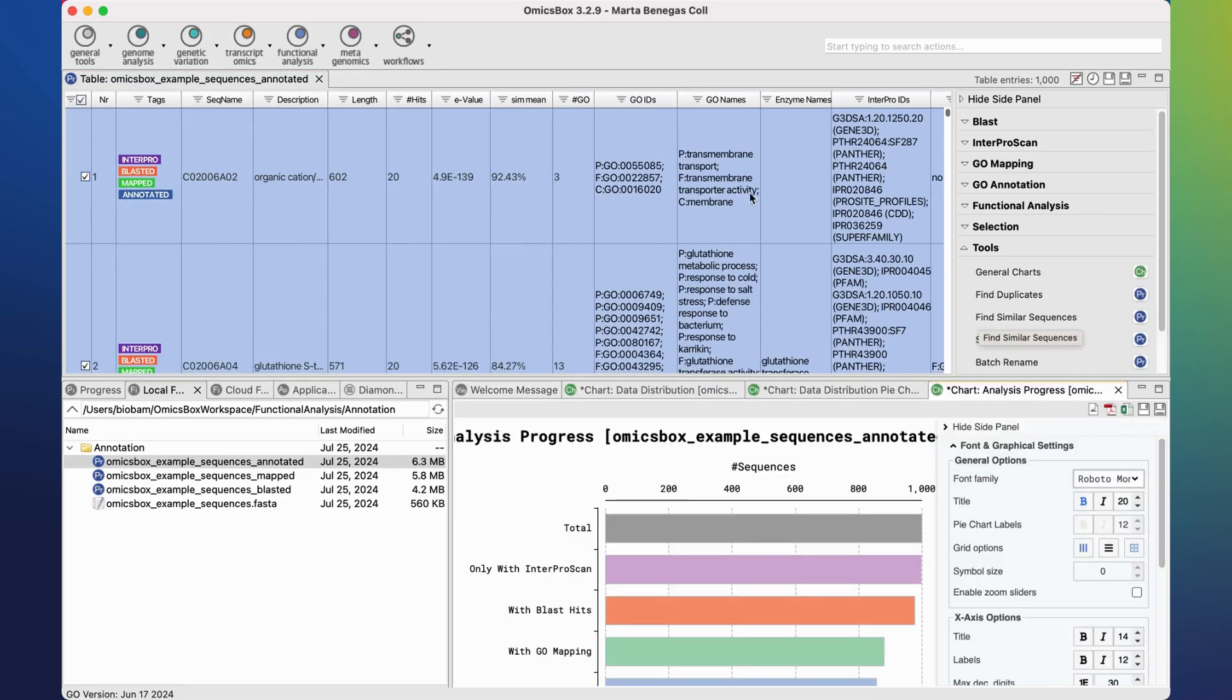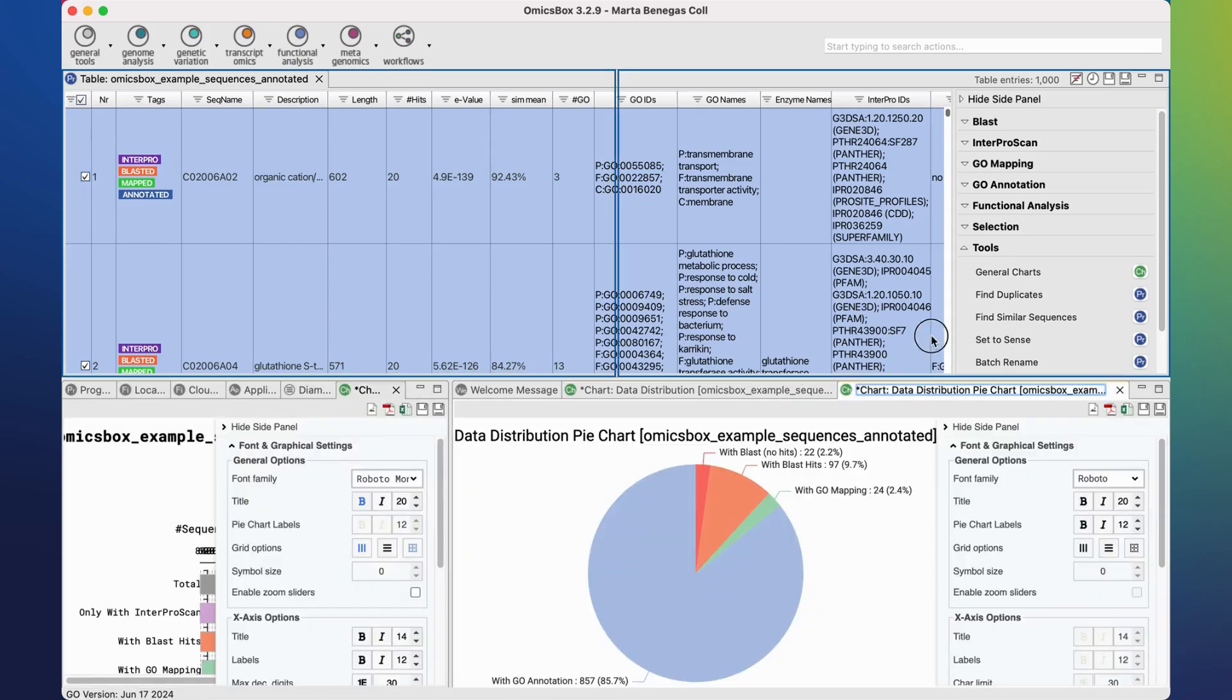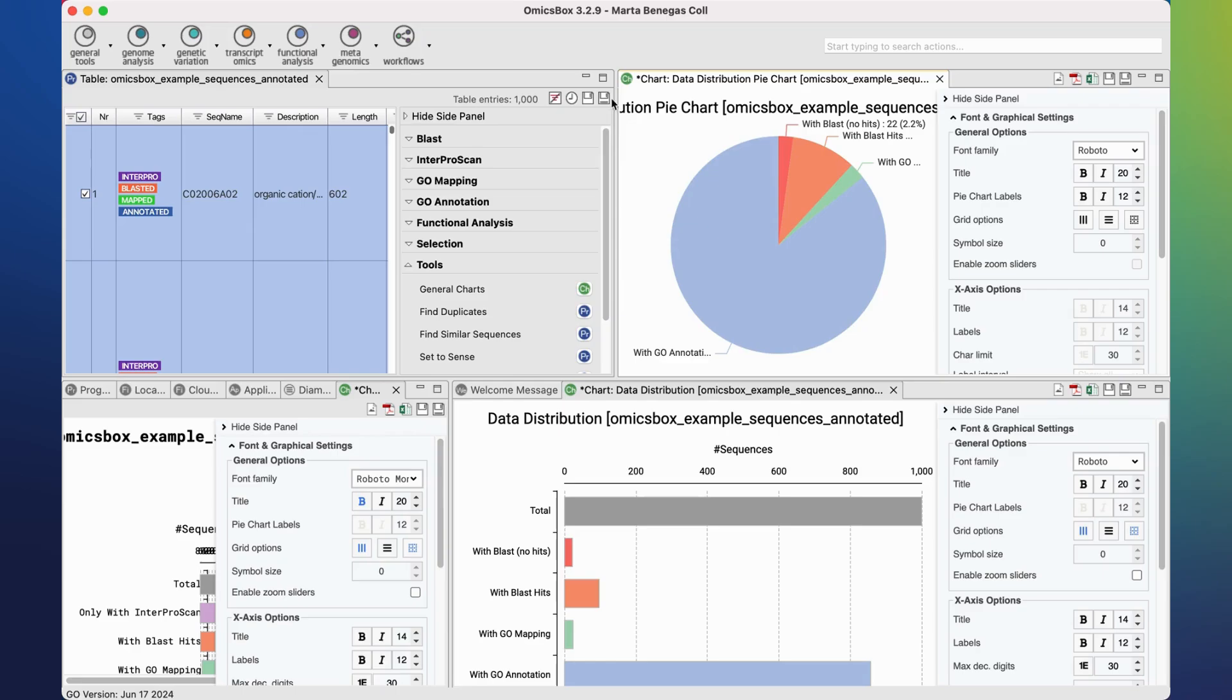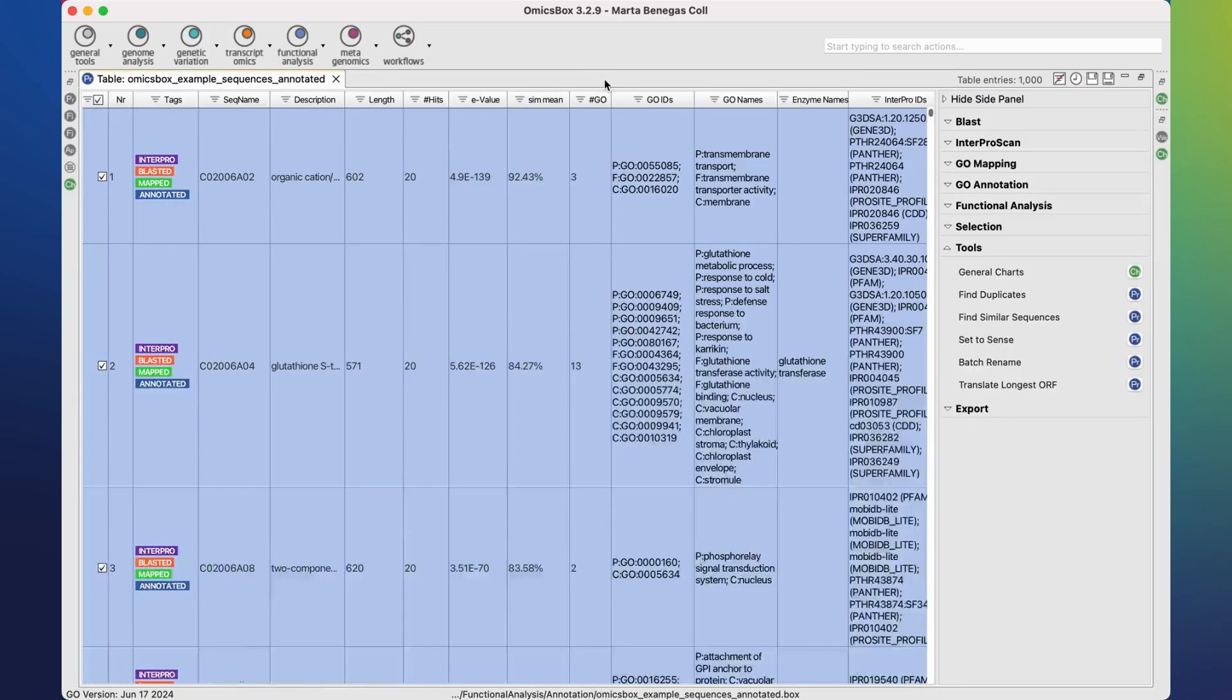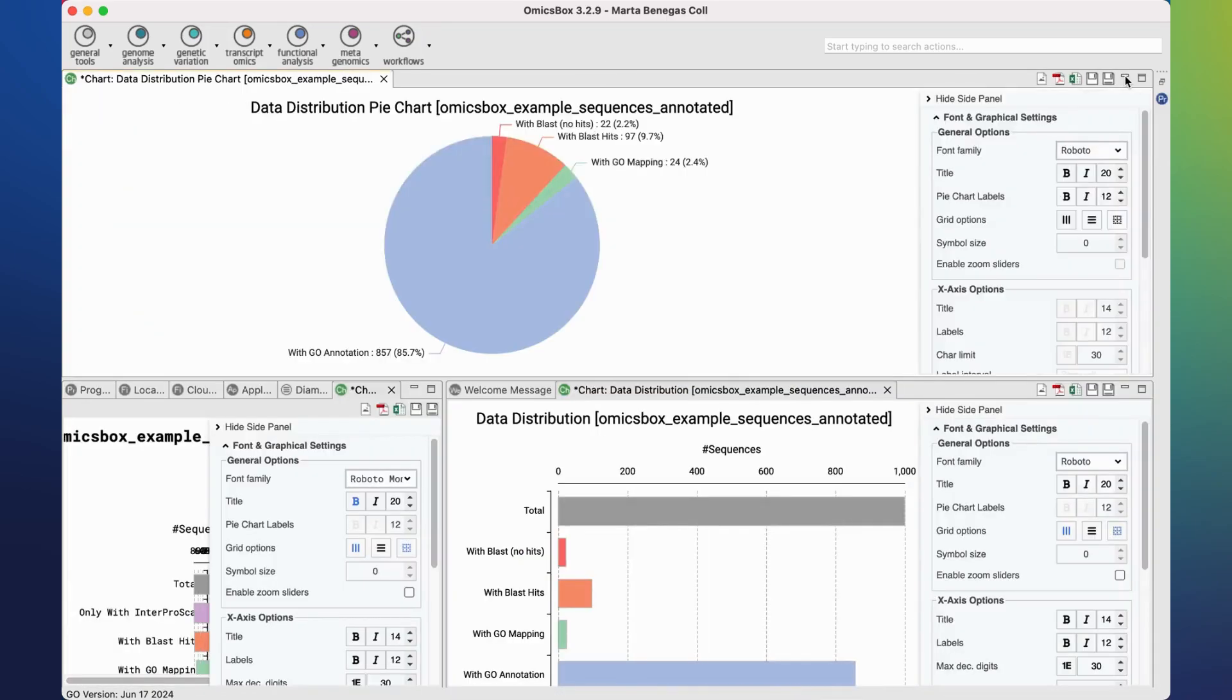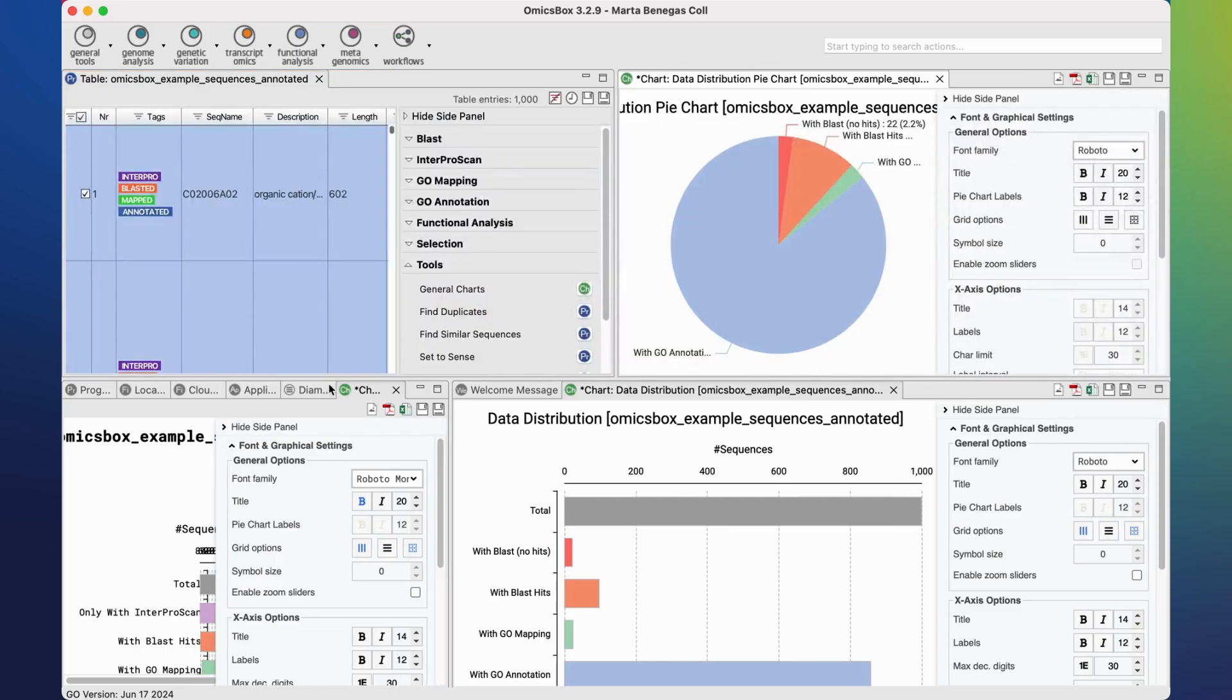Although this is the default viewer distribution, the different tabs can be moved, put side by side, they can be maximized or minimized to adjust to your preference.